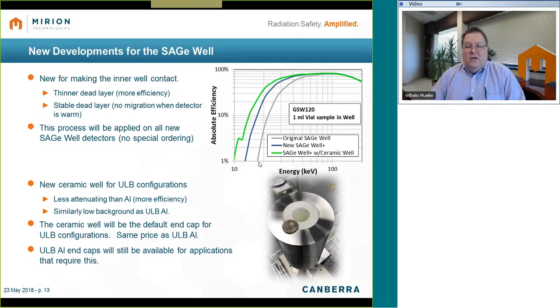The gray curve is the original efficiency response of our standard well detector contact, and the blue curve is the efficiency response for our new contact technology.